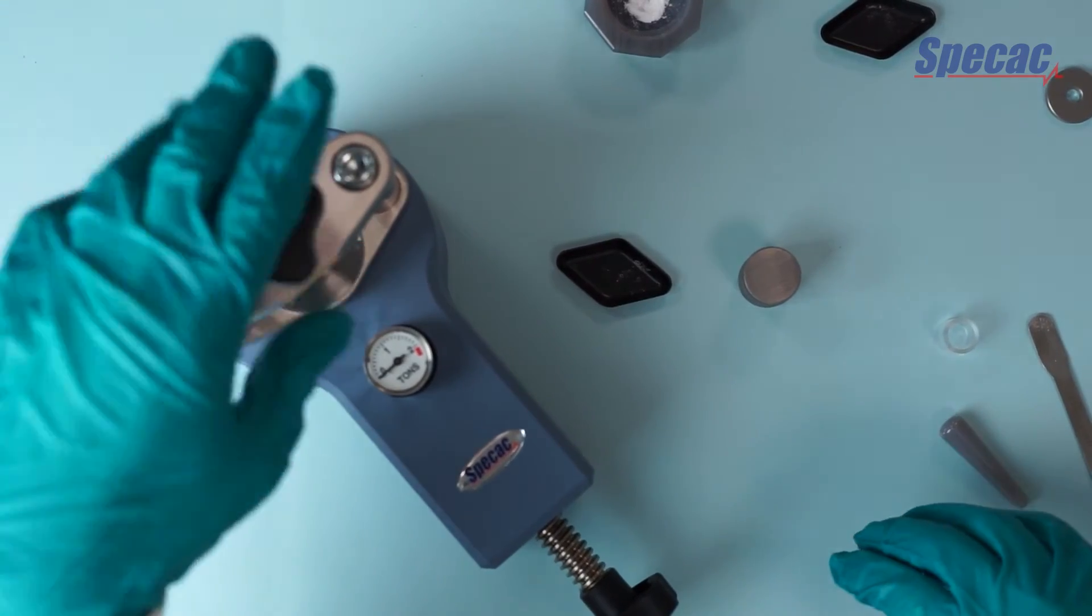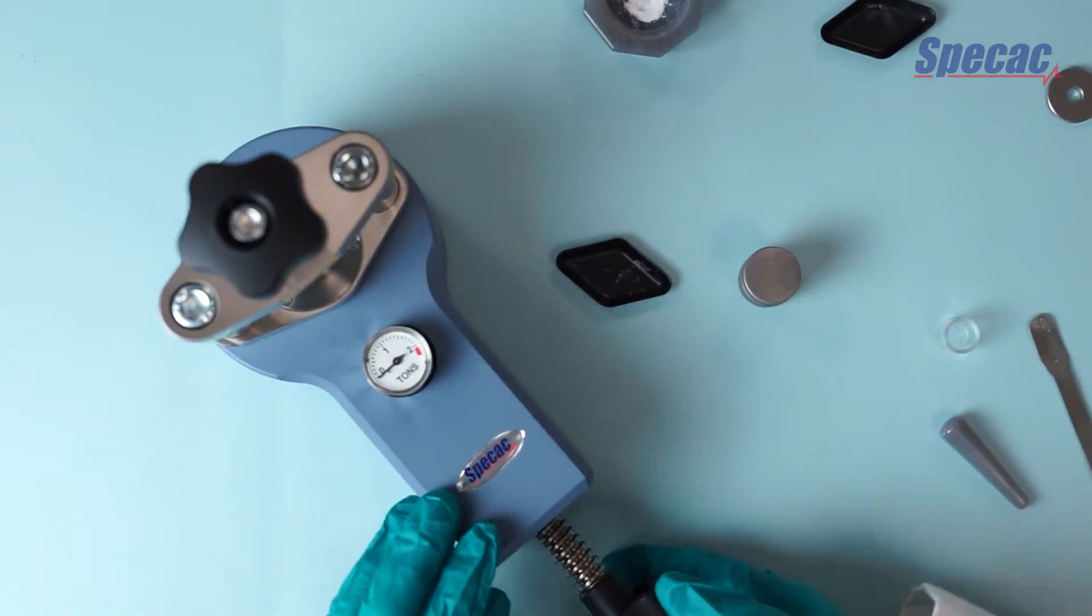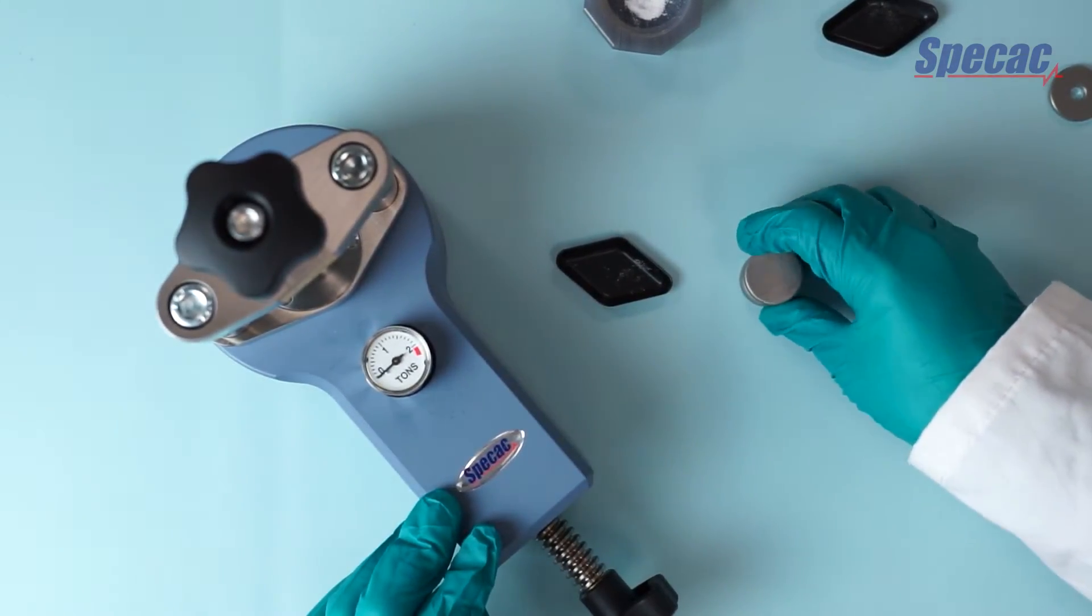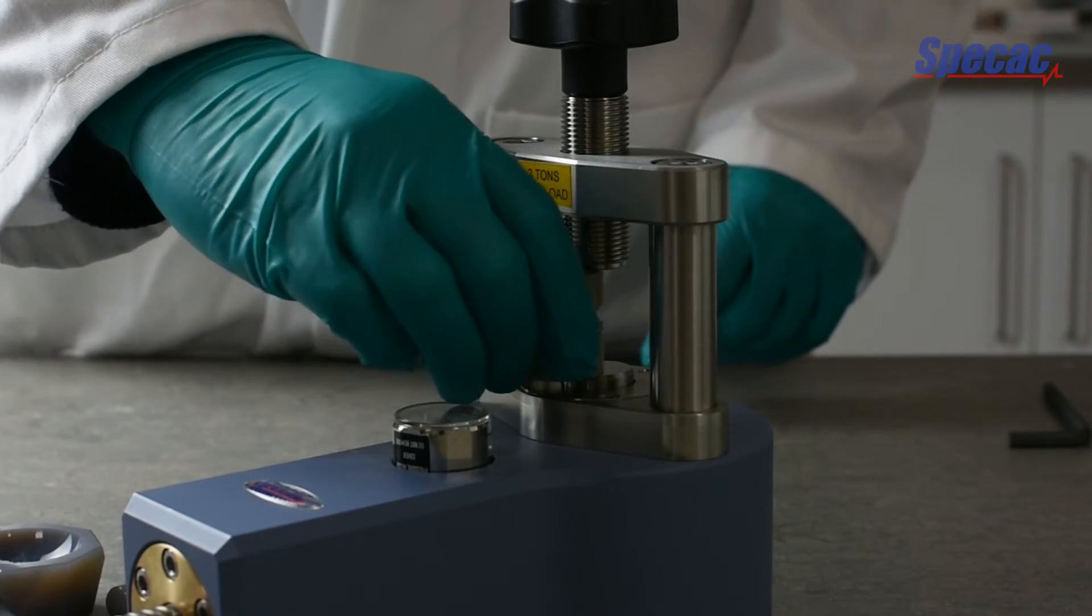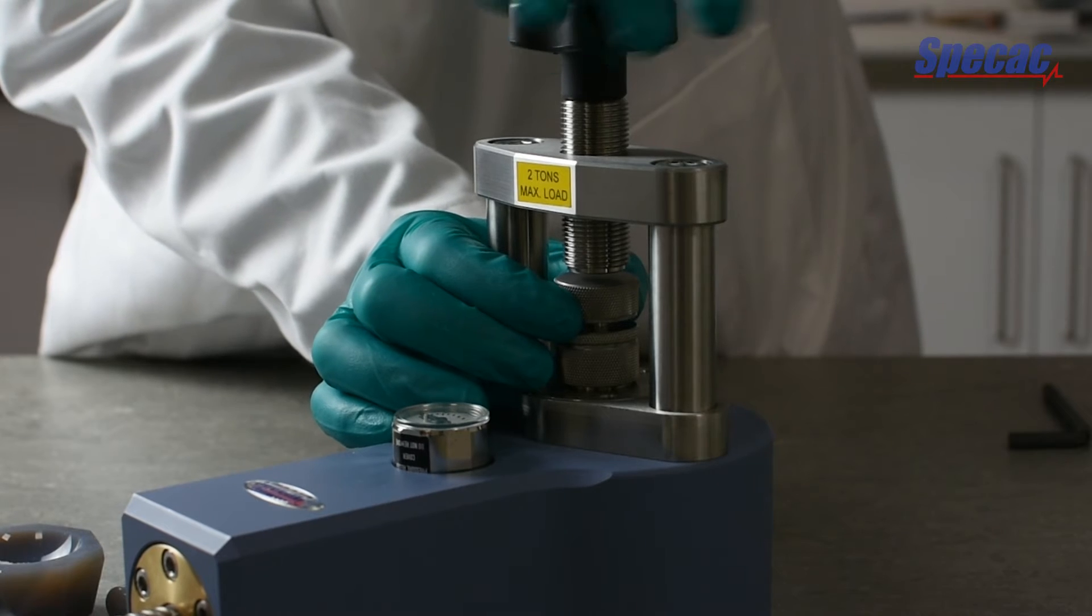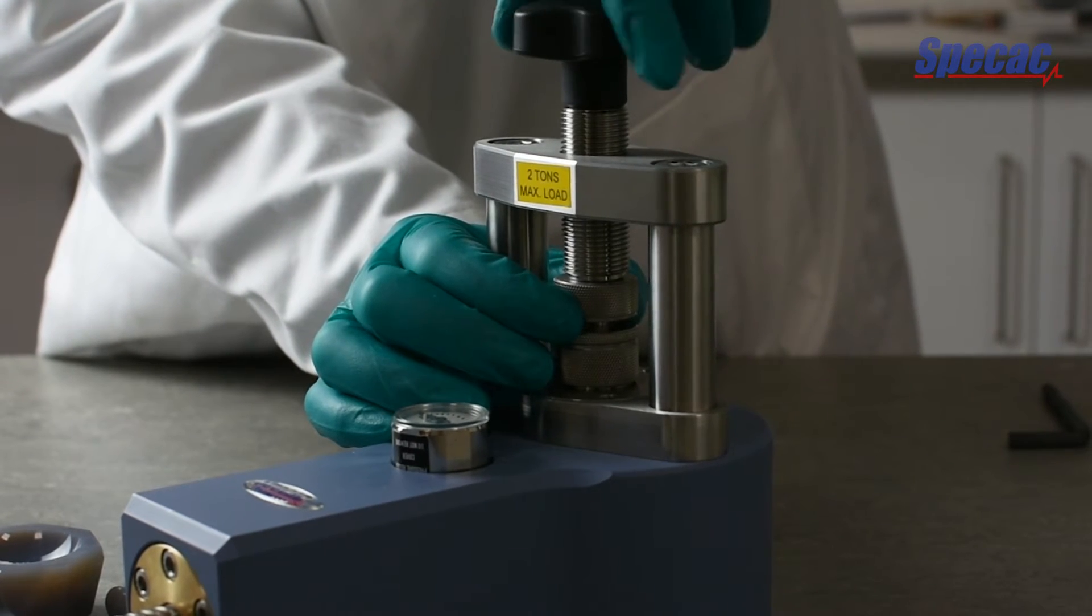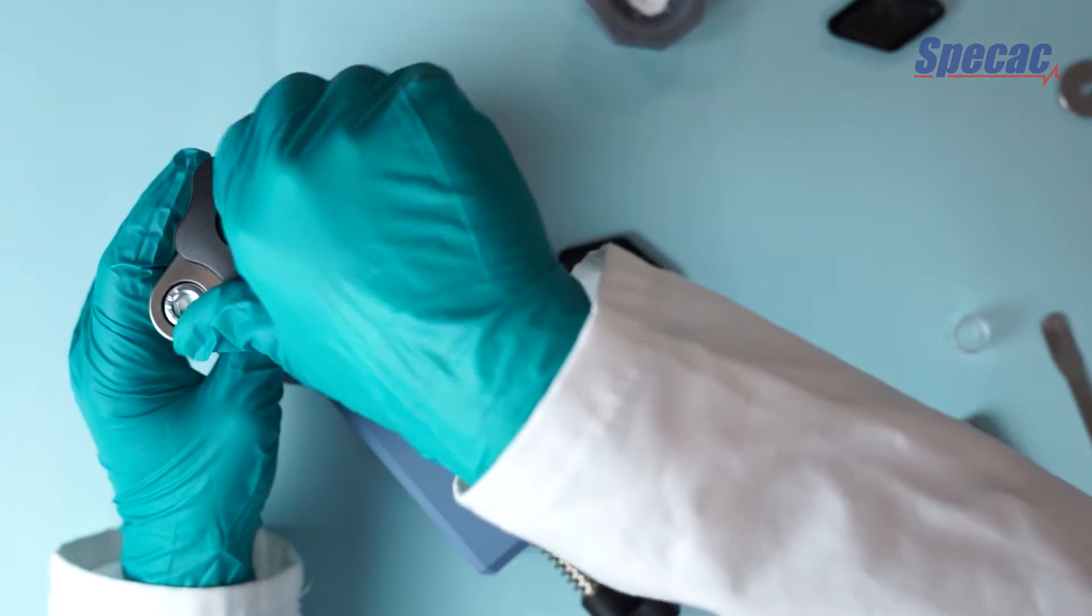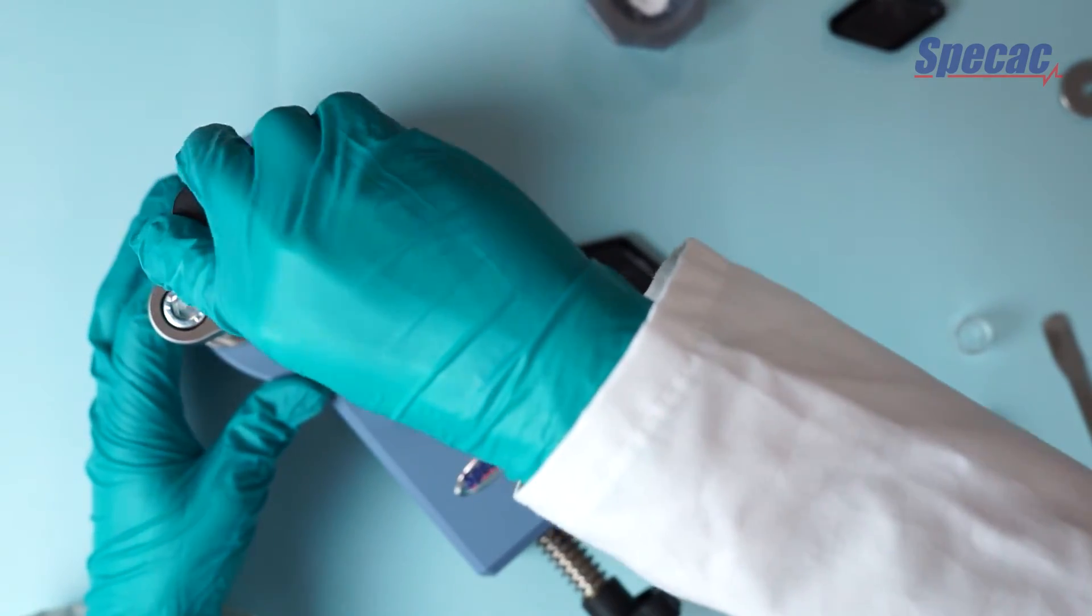Now we transfer everything to the press. We turn the lead screw counterclockwise to create space. Gently maneuver the pellet die into position. Tighten down the lead screw to hand tight.